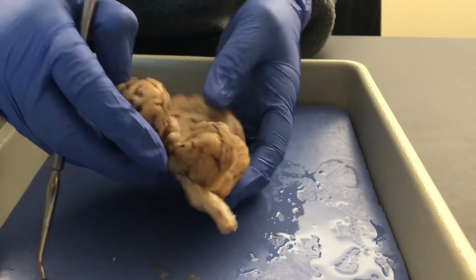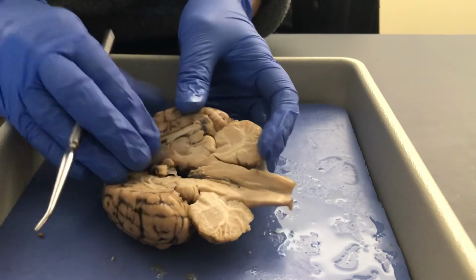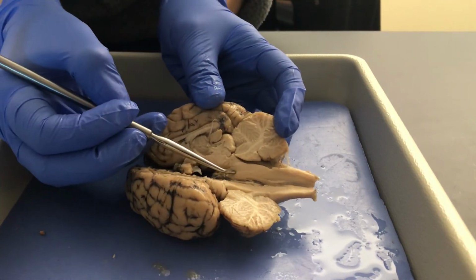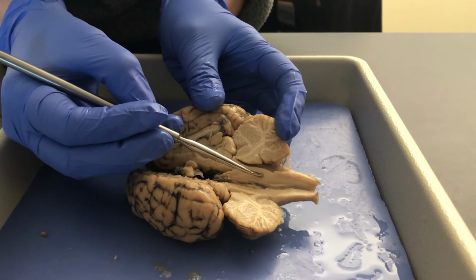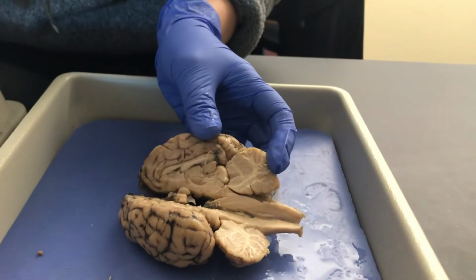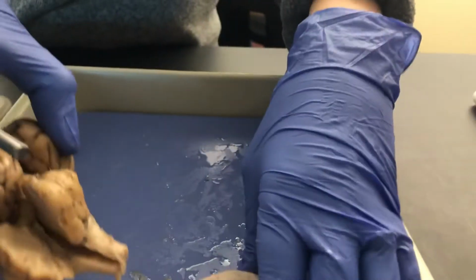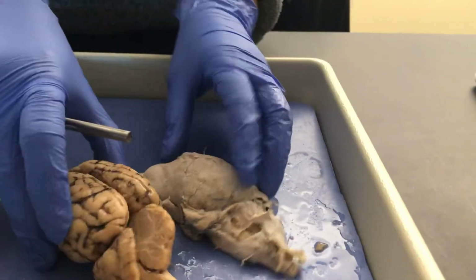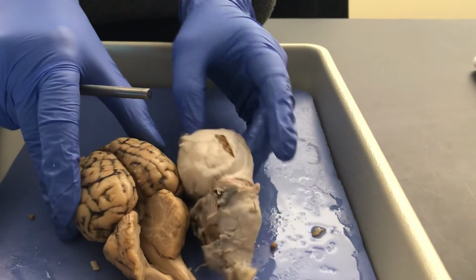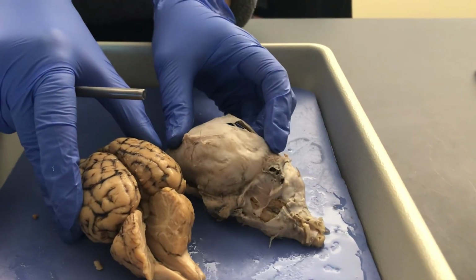And you can actually see the pons, the medulla oblongata, and the spinal cord from the inside view as well. And here you could see the dura mater that's completely covering the brain, one of the three meningeal layers.